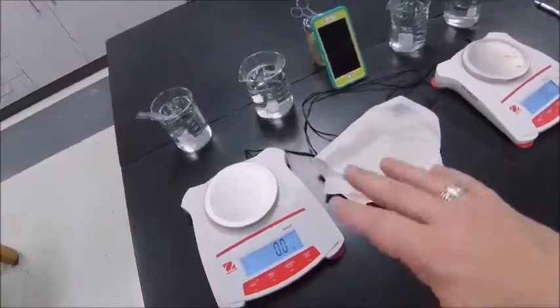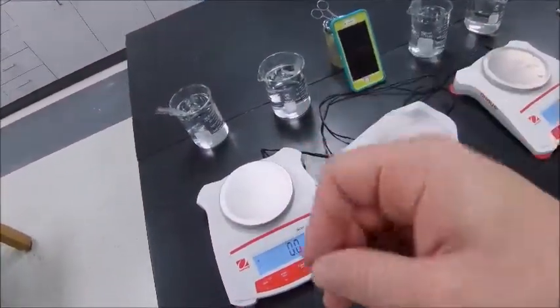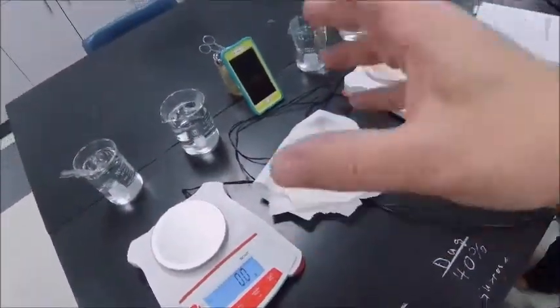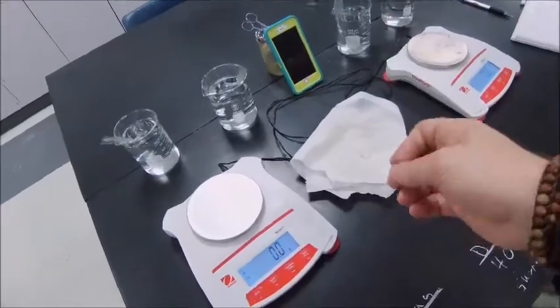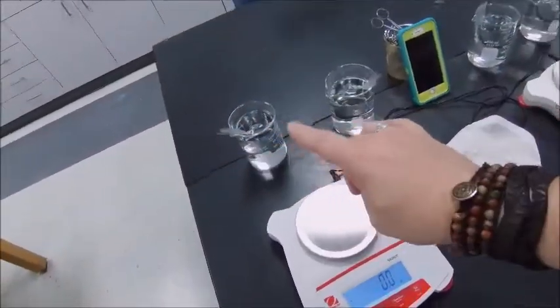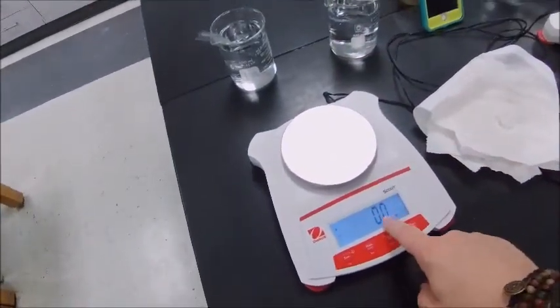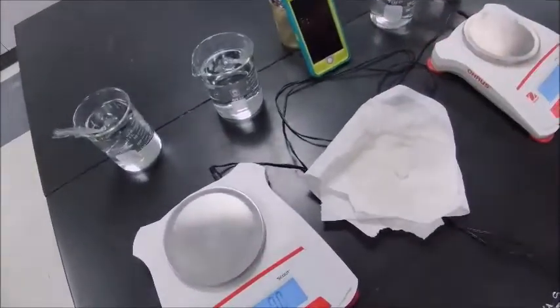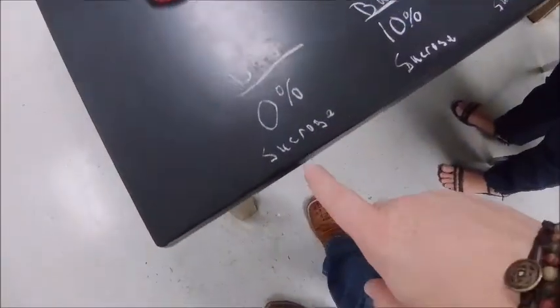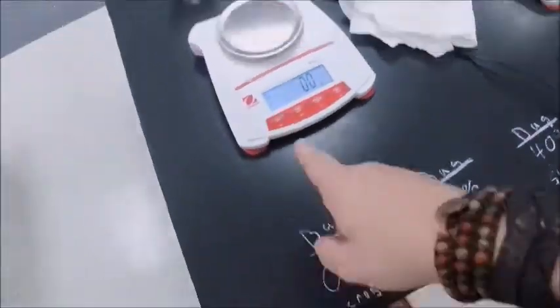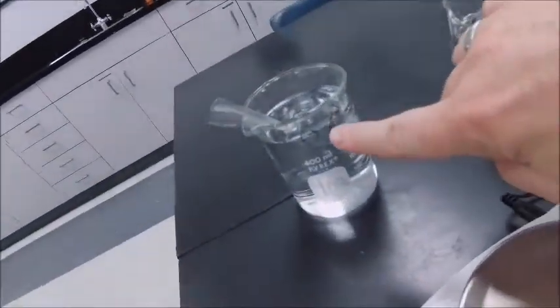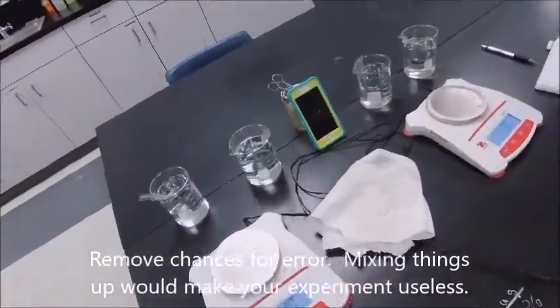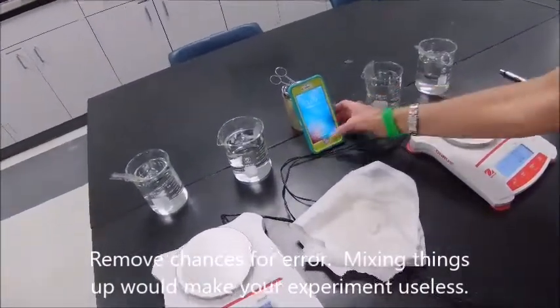We're demonstrating the weighing procedure. As we take the bags out, we dab them a very specific and consistent number of times to remove as much water from the outside as possible. Then we verify the scale is tared at zero grams, weigh the bag, and place it immediately back in the water to keep up with our timing. Everything is carefully labeled — both on the table and on the glassware — and we're keeping track of weights in the lab manual.